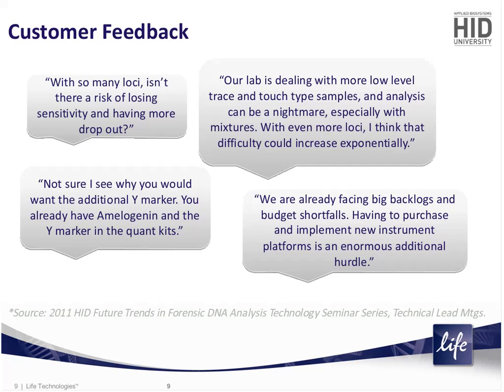And ultimately, whenever a new system is coming on stream, the question of budget is always very large in the thoughts of the forensic laboratory. Many labs are already facing big backlogs, and also with the current economic climate, budget shortfalls are common. So potentially having to purchase and implement a new instrument platform to run a new chemistry would be an enormous hurdle. So we need to make sure that we can make any new system as compatible with all of our instrument platforms as we can.